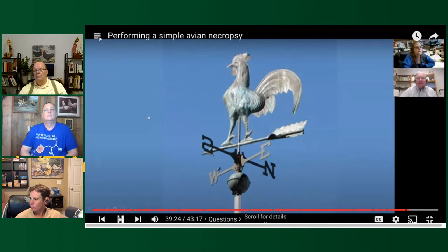That's pretty much it as far as the general opening of a chicken and looking for normal tissues. Now are there any questions?